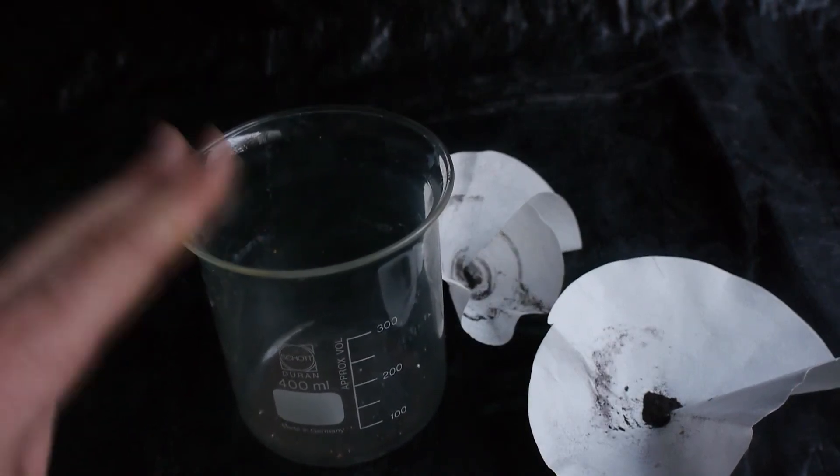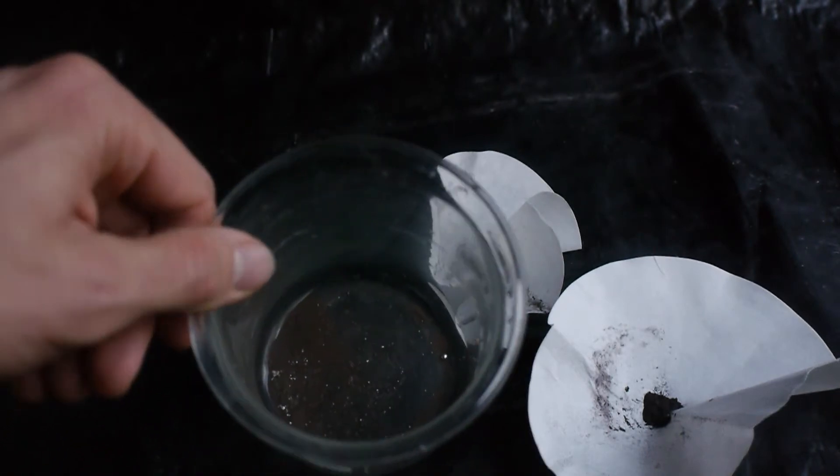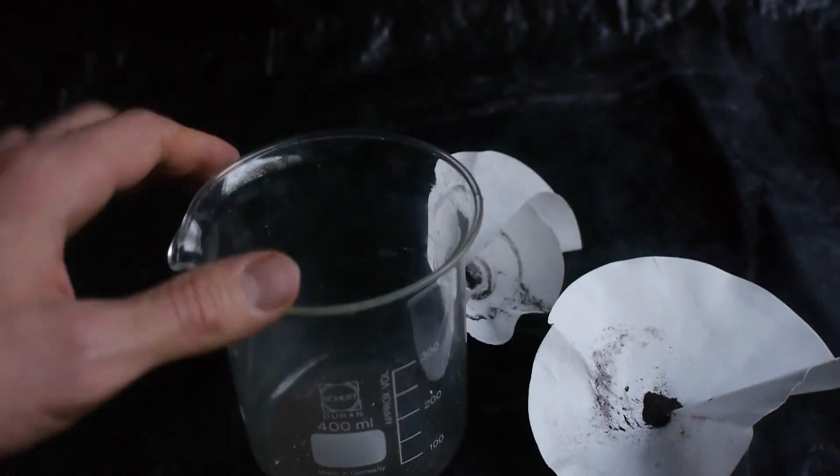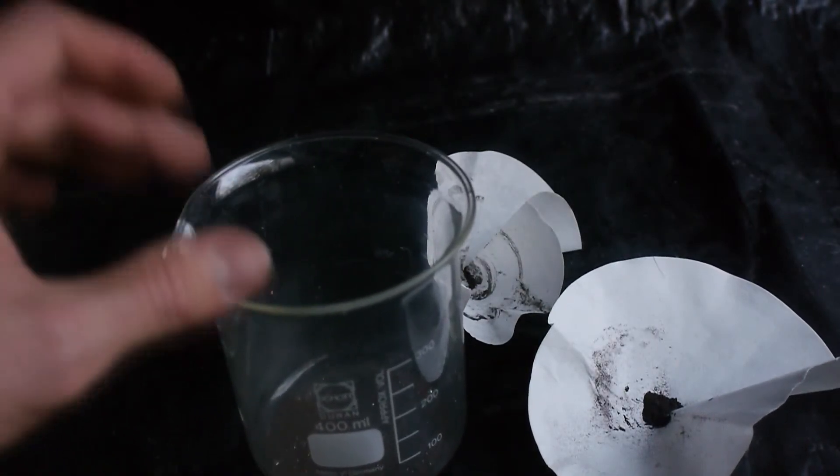Before I can heat this I need to make absolutely sure that there is no more mercury in there. And as you can see there is still some mercury in there. So I'm going to heat this under a vacuum. And distill out any remaining mercury.